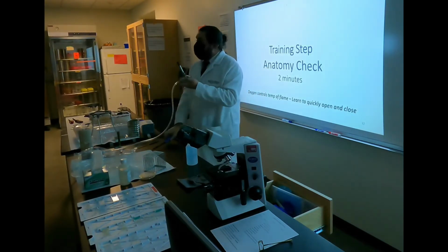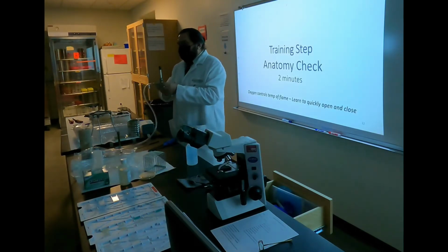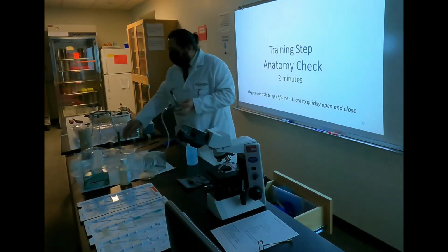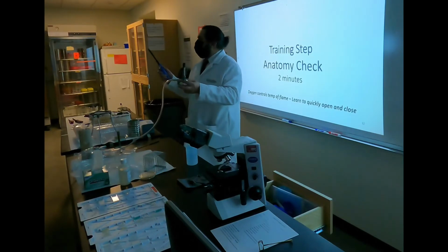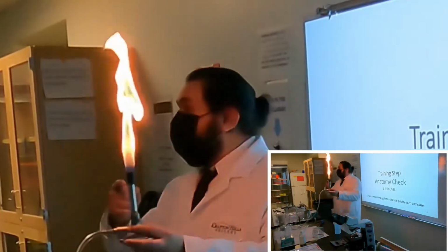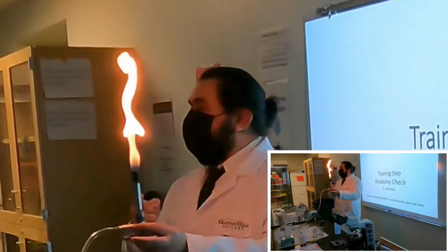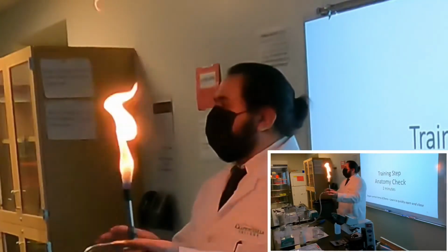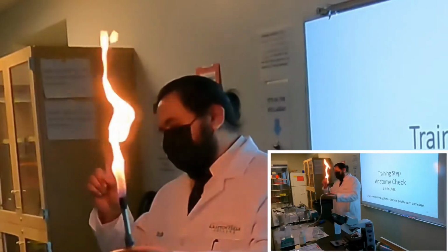All right, so I'm going to show it to you. I'm going to show you kind of what you shouldn't be doing, obviously, and then you'll get to practice it. I'll let you guys do it and then play with it. So, gas. This should be on already, but I don't have two hands. Fun, right? The longer you leave that open, the bigger the kaboom is going to be. Now, don't try this at home, kids. This flame is not very useful for us because it's cold.